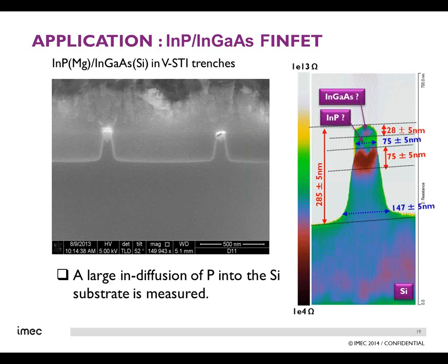And of course, these kinds of features you can only see if you have a 2D structure. Also, I encourage you to look at the dimensions. You can see that we also speak about very small dimensions. The indium gallium arsenide layer, for instance, is smaller than 30 nanometer in depth.